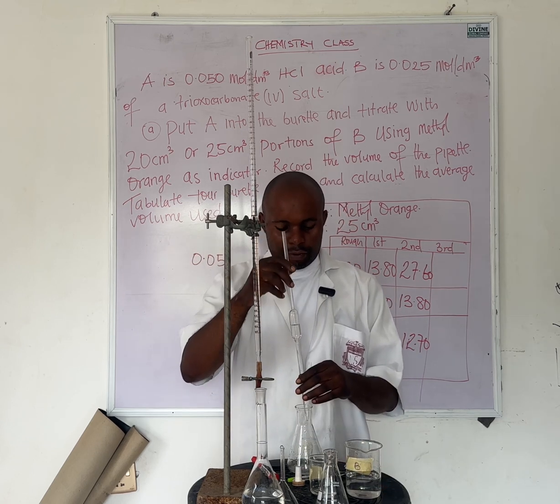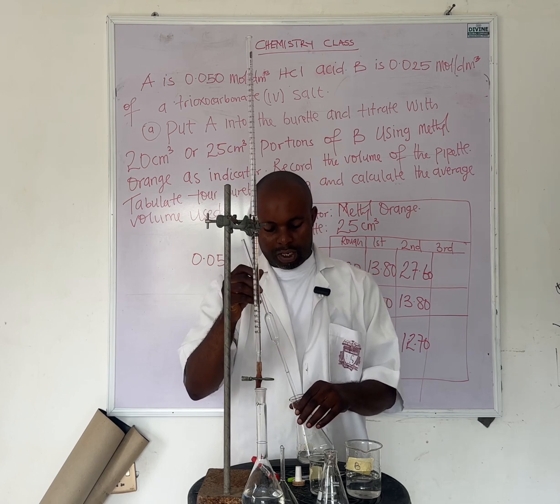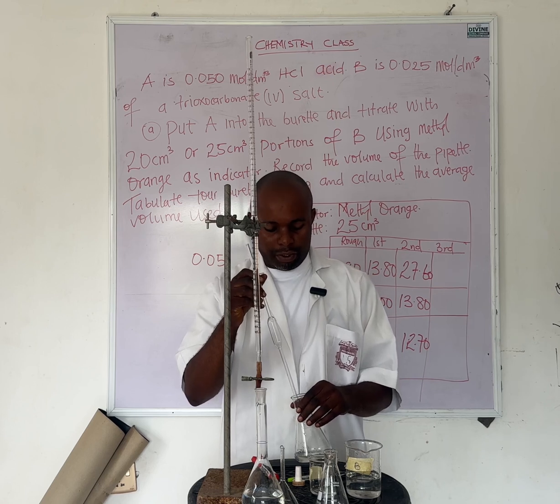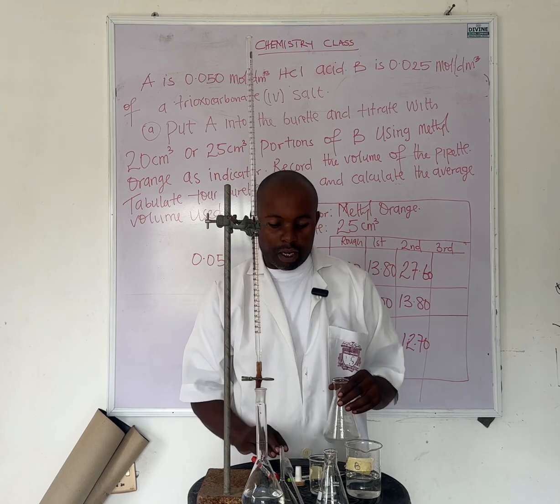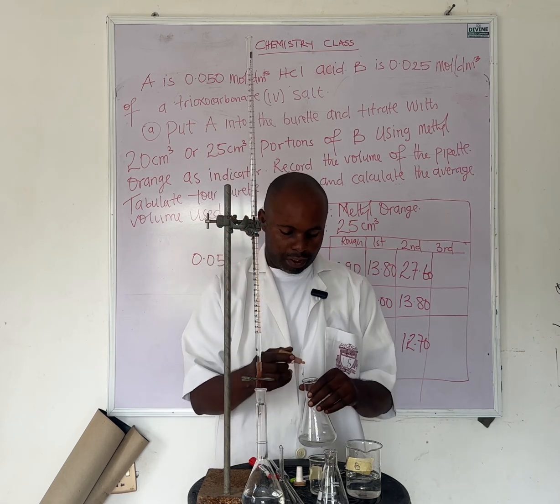If it is convenient for you to refill all throughout, you can refill, but it doesn't actually mean that you must start with 0.00. You can start from 0.10, 0.20, 1.10, 2.10, and so on and so forth.